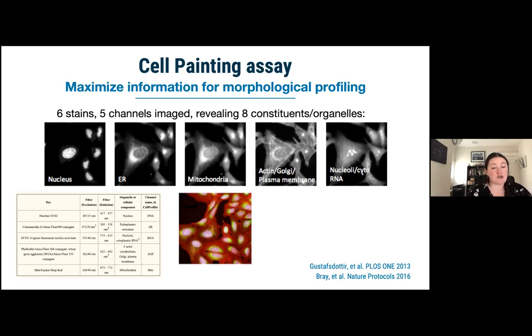And yes, texture and granularity measurements do help us find differences in small organelles, like whether they get bigger or smaller. There's a paper we've done with another group that is going to be submitted soon, where they looked at how the granularity scale, which I didn't talk about, works. Granularity is essentially a measurement where you say, I'm going to delete all of the dots of size 1 from the image, and see how much signal is left.